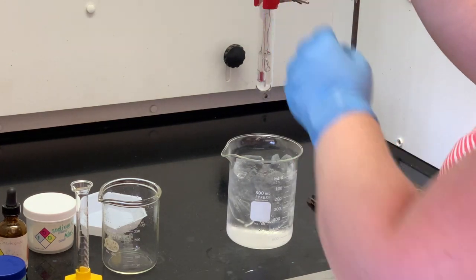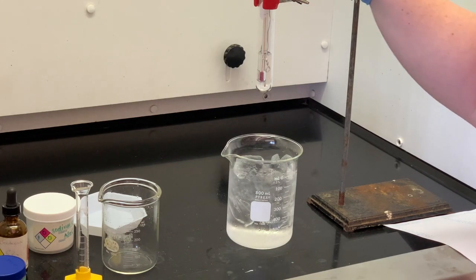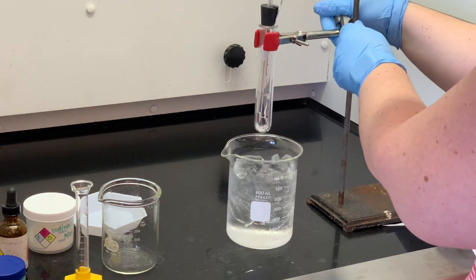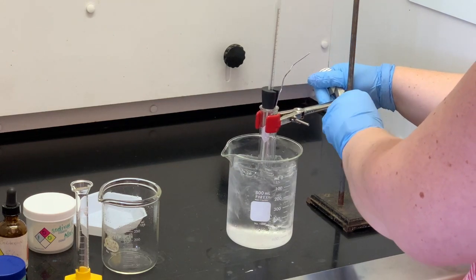Once that is frozen, that's when we're going to start measuring the time. Every 30 seconds we're going to take the temperature until this solution gets to about 10 to 12 degrees Celsius. We're going to lower the test tube into the ice bath and then just wait for it to freeze.